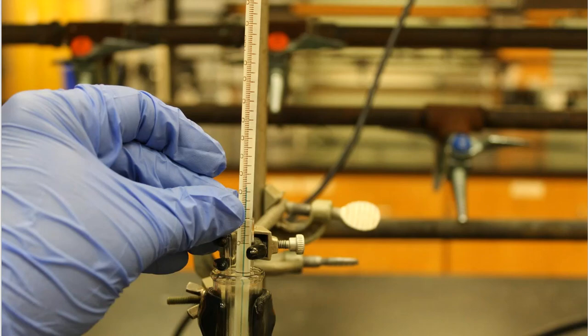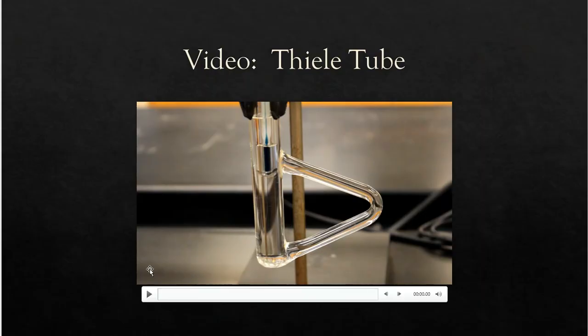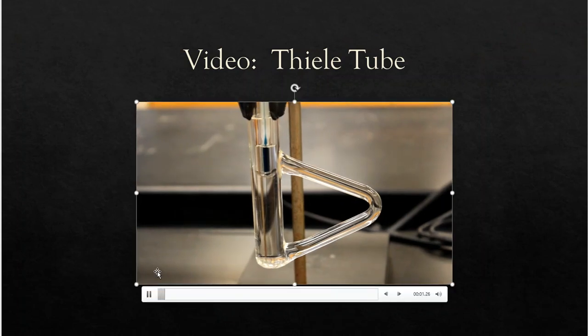All right, so before we go further, I've got a video of the Thiele tube I'd just like to show you before I move on.